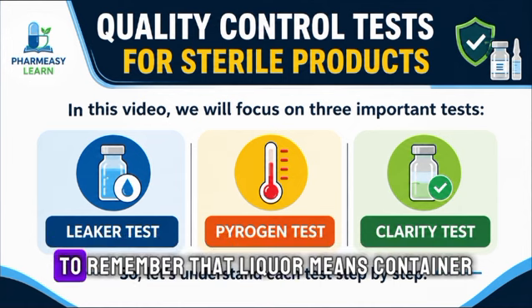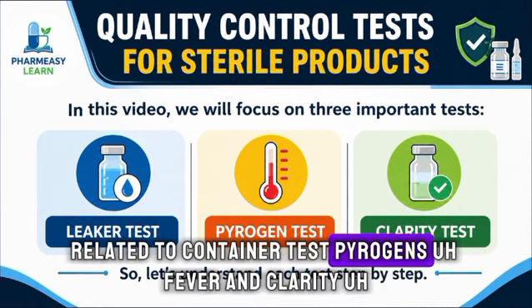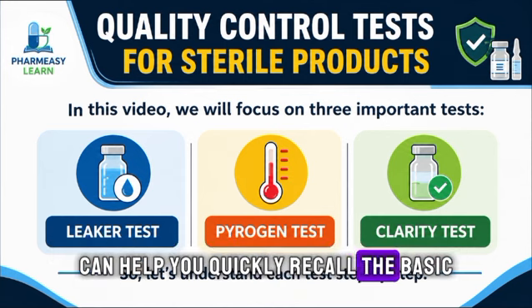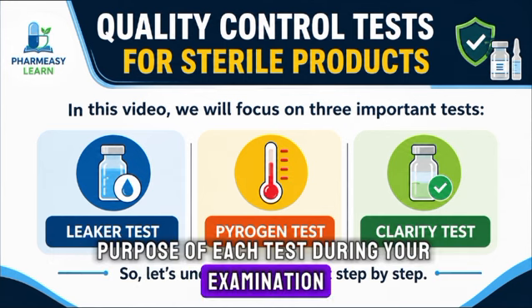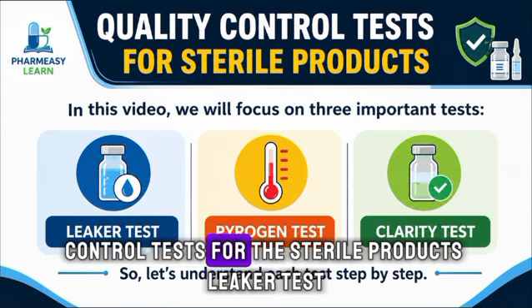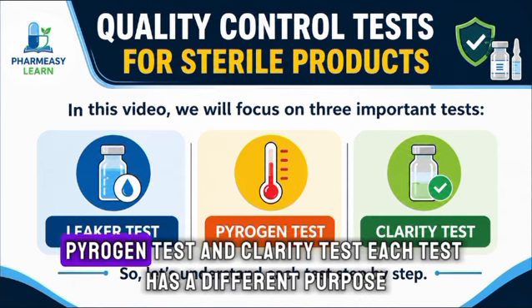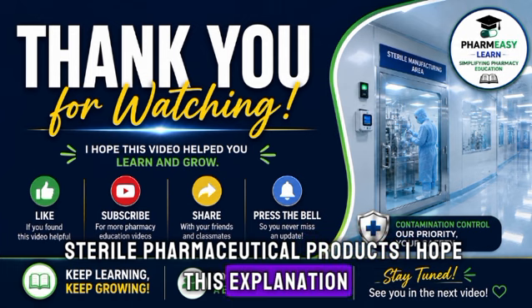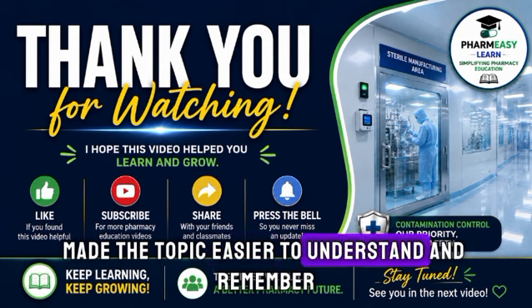Here is a way to remember: leaker means container, related to the container test; pyrogen means fever; and clarity is linked to visible particles. So these three keywords can help you quickly recall the basic purpose of each test during your examination. So today we discussed the three important quality control tests for sterile products: leaker test, pyrogen test, and clarity test. Each test has a different purpose, but all of them contribute to ensuring the quality and safety of sterile pharmaceutical products. I hope this explanation made the topic easier to understand and remember.